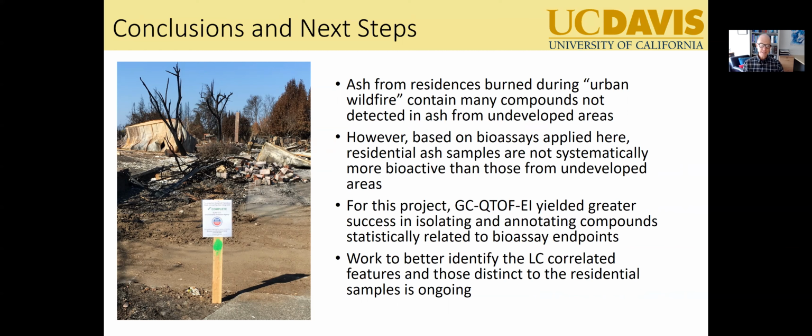And we also did not see any systematic presence of the kinds of compounds that you would see in a typical environmental contaminants database. That is, after this fire, we don't see a lot of residue of known pesticides or known solvents. What we're seeing is highly converted compounds that have been subject to combustion.